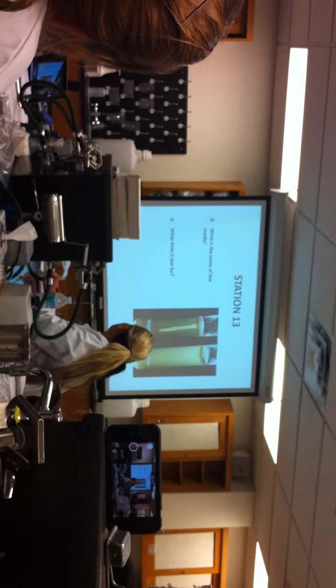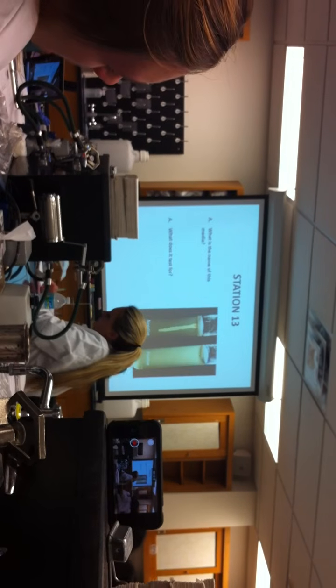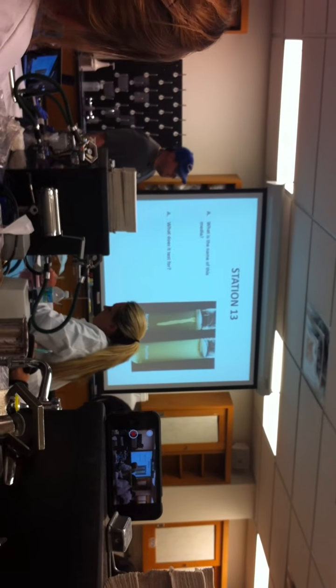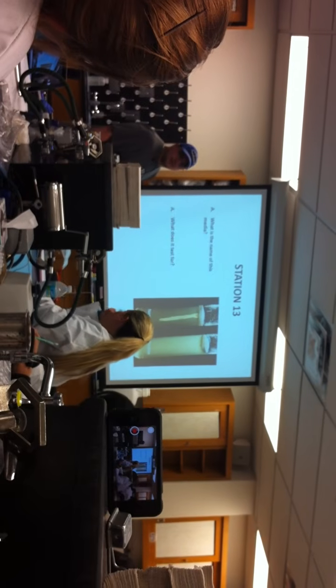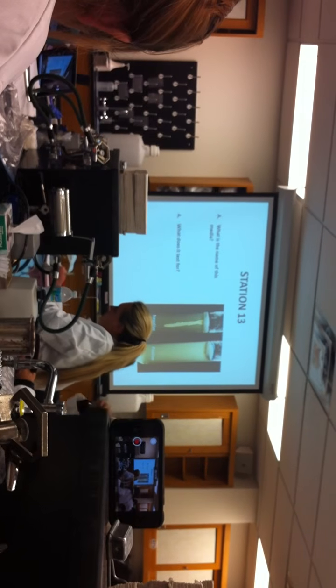Okay, remember this test? That is the motility media. We call that the SIM tube. So, this is the SIM tube, and it's testing for the ability of bacteria to either stay where you put them or to move all over. And that is a motility test. So you're looking for the presence of flagella or motility.